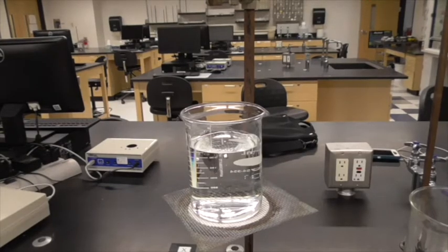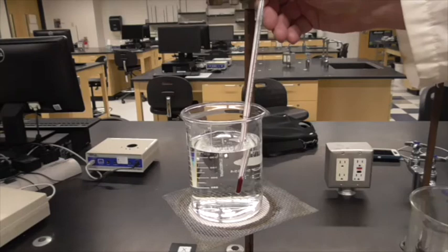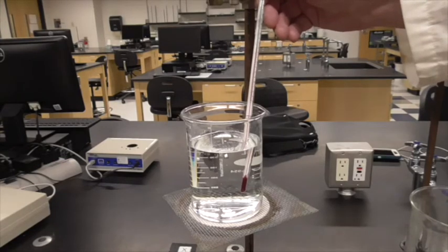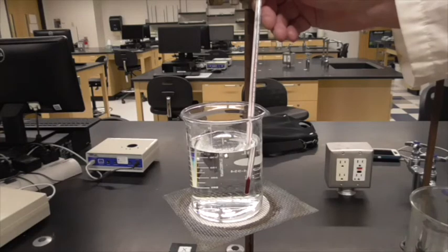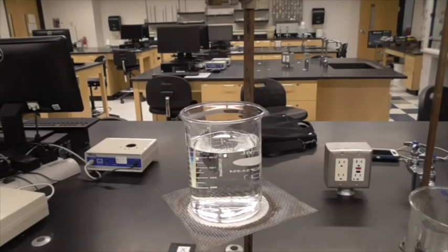Alright, let's check it again. I don't think it was going to take very long. It's just hanging a little bit below 30. Here, we're right about 40, so we'll stop it there and then we'll wait for the sample to melt.